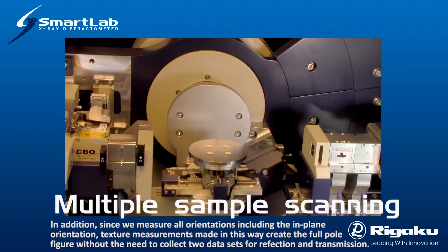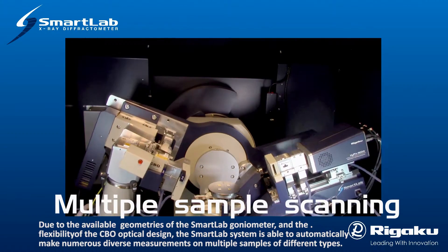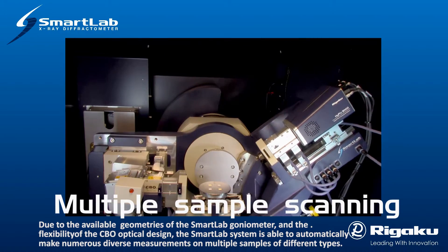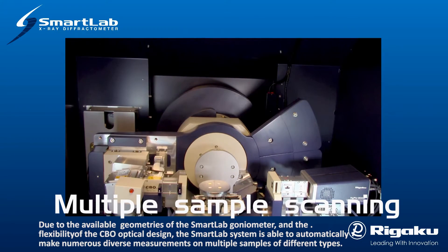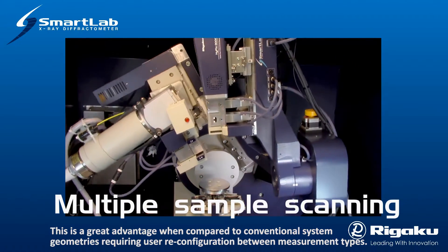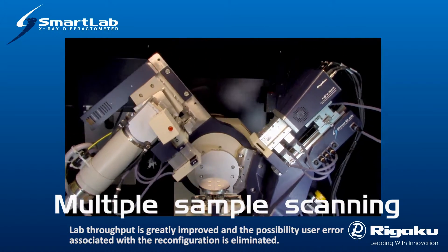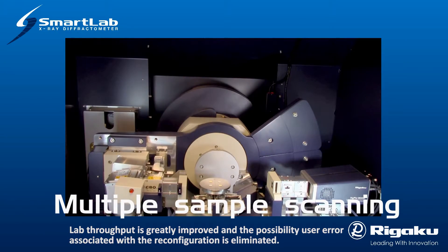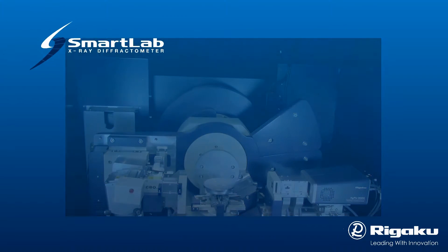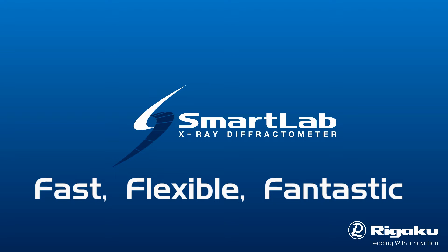Due to the available geometries of the SmartLab goniometer and the flexibility of the CBO optical design, the SmartLab system is able to automatically make numerous diverse measurements on multiple samples of different types. This is a great advantage when compared to conventional system geometries requiring user reconfiguration between measurement types. Lab throughput is greatly improved and the possibility of user error associated with reconfiguration is eliminated. SmartLab: Fast. Flexible. Fantastic.